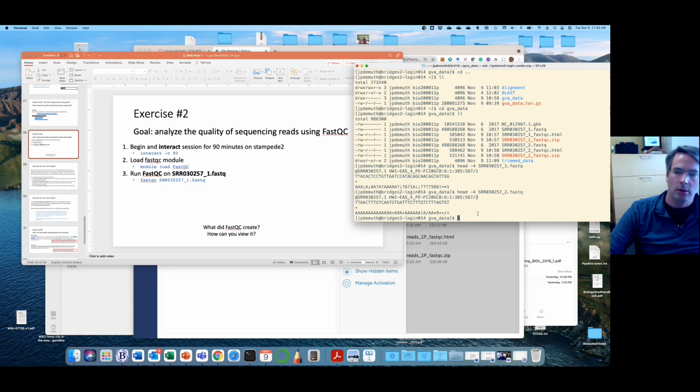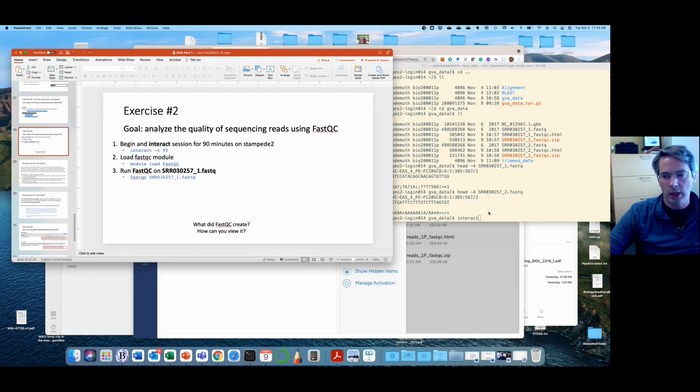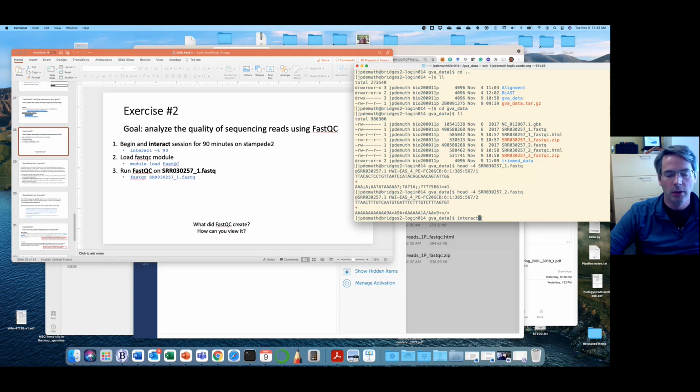The first thing you'll want to do is start an interact session. You don't have to do it for 90 minutes. I just said that because it would take up the whole class period, but these jobs will finish much faster than that.